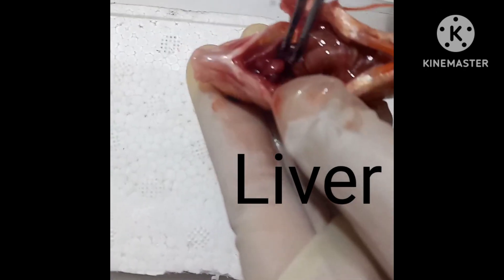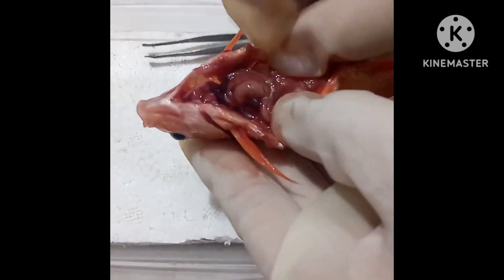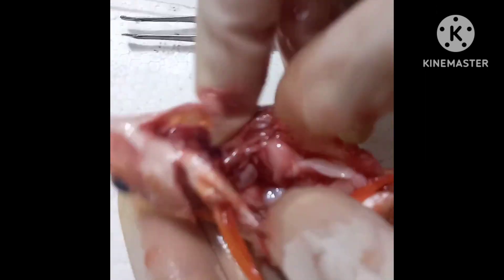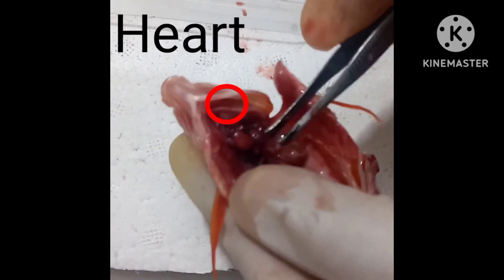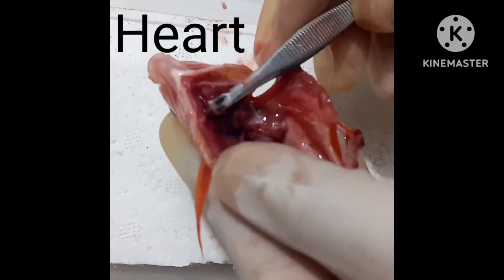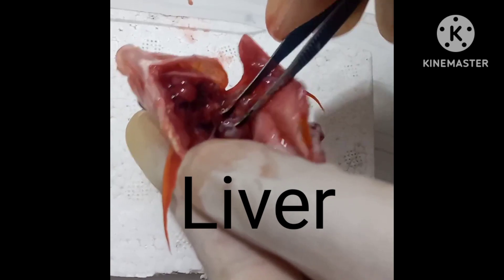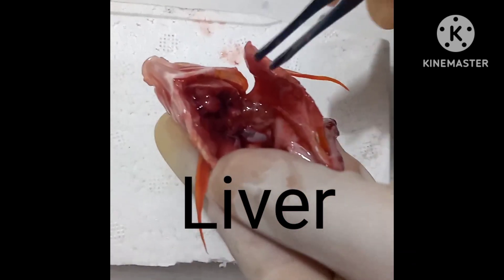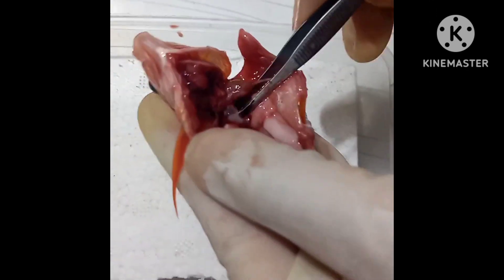This is its liver. Its heart circulates the blood throughout the body. The liver helps in digestion by secreting enzymes. The liver also works as a storage area for fats and carbohydrates.